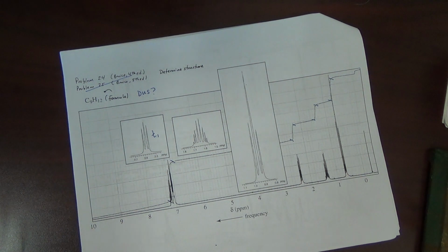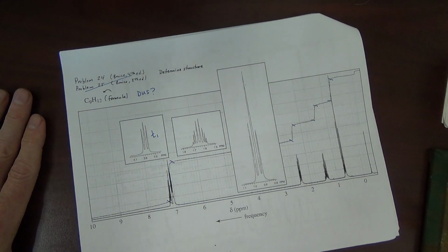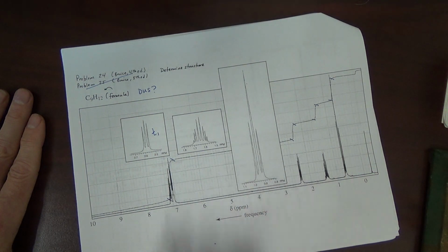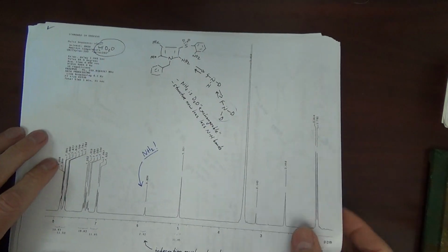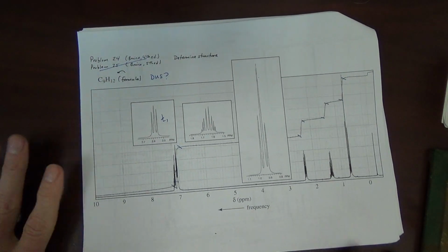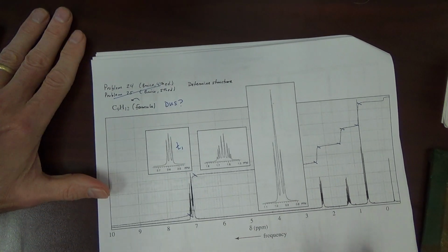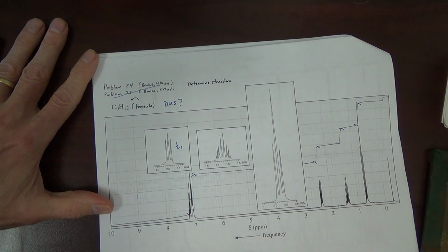Hi guys, in this fourth NMR video I will work some of the practice problems in the handout. These practice problems early on will focus primarily and only on Proton NMR. So this first one, the goal here is to determine structure.